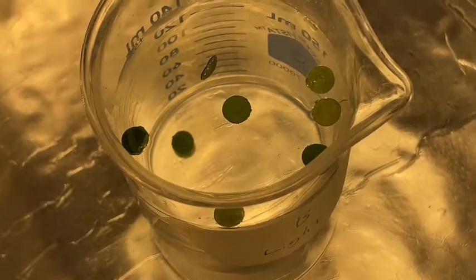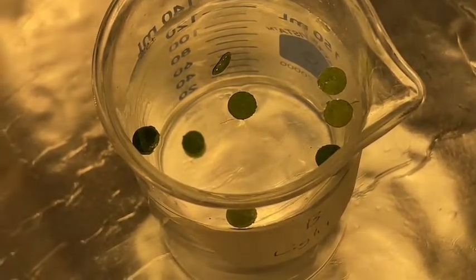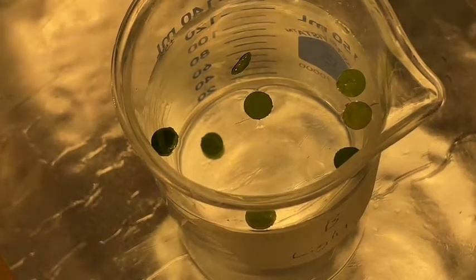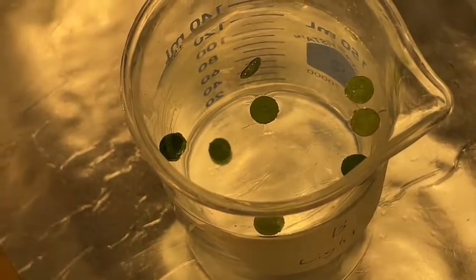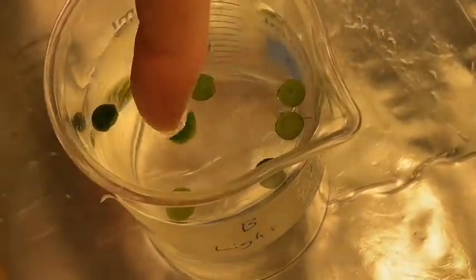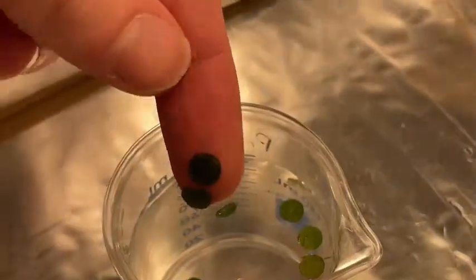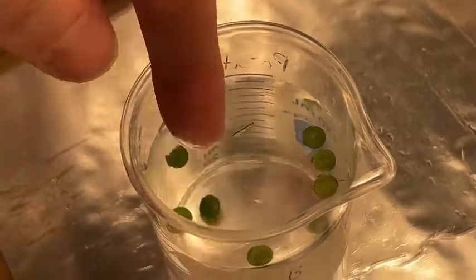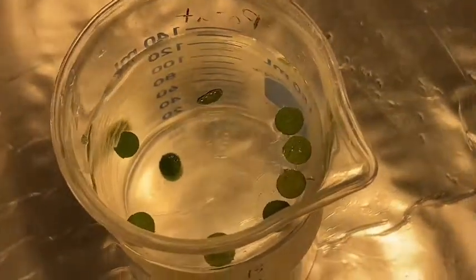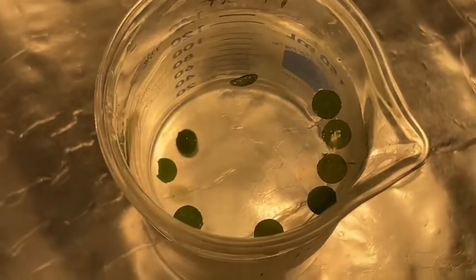One thing students should be sure to do is count the number of leaves that they have at the bottom of the beaker, because sometimes they are on top of each other. So I just realized I made a mistake. These leaf discs right here are actually two different ones that have been stuck together. That should not have been the case. If I put them back in, that introduces some experimental error into my experiment, so I don't want that.